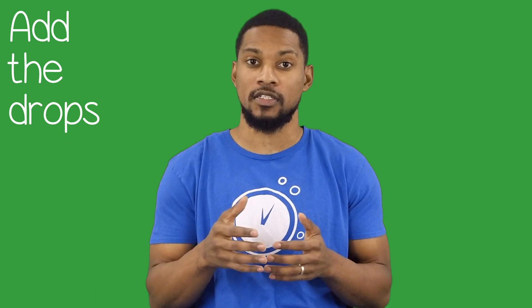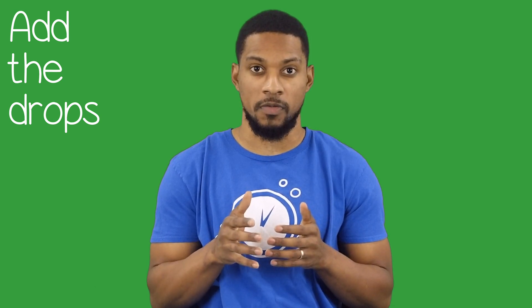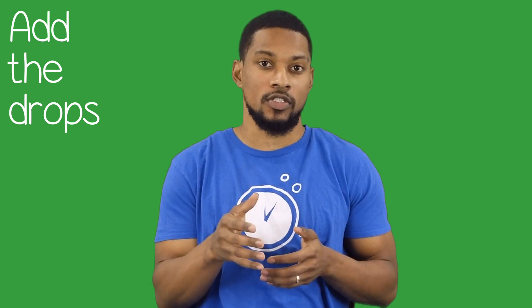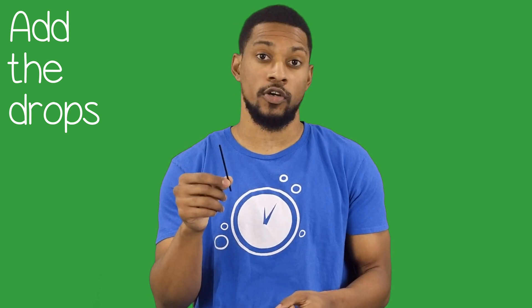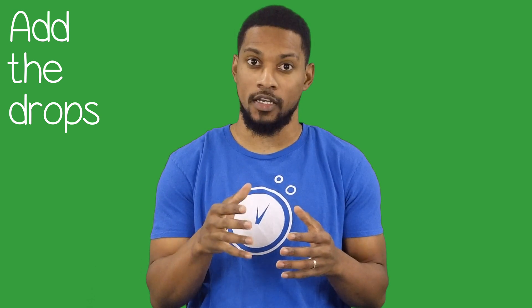Remember, each drop is equivalent to 0.1 milligrams per liter or 0.1 ppm, so it's vital that you count each drop that you add. Because one drop is equal to 0.1 ppm, if the water you are measuring is lower than 0.1 ppm, then H2Blue will not be able to detect it. When adding the drops, make sure you are applying a gentle and consistent finger pressure. If you squeeze the bottle too hard, you can enlarge the droplets, resulting in a lower or inaccurate reading. One way to add drops is one drop at a time to see if it clears. You can use the stir straw provided with H2Blue or give it a little swirl. The swirl is what I prefer, but I have a lot of practice. There is a fine line between swirling and shaking — remember that.